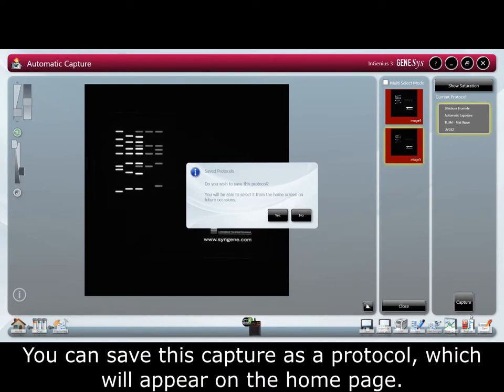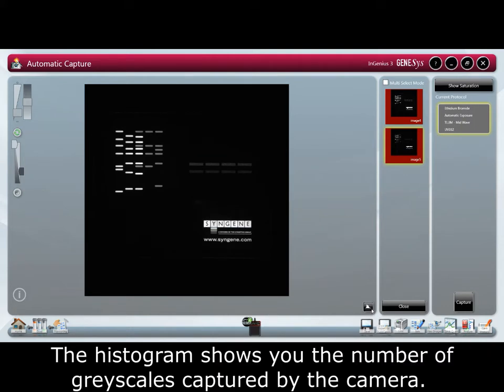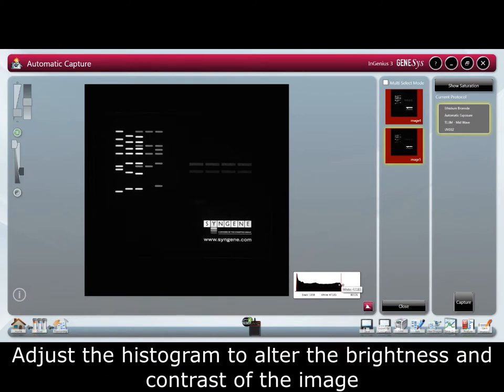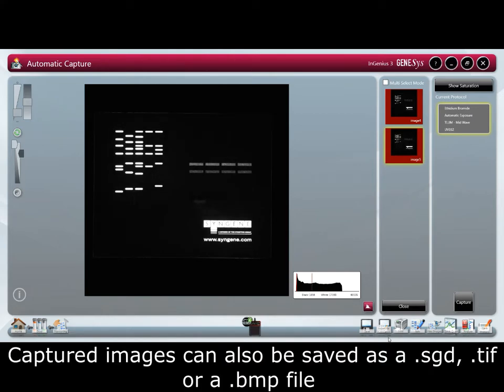You can save this capture as a protocol which will appear on the home page, saving you time as it takes you directly to the sample positioning page. The histogram shows you the number of grayscales captured by the camera. Adjust the histogram to alter the brightness and contrast of the image. Captured images can also be saved as an SGD, a TIFF, or a BMP file.